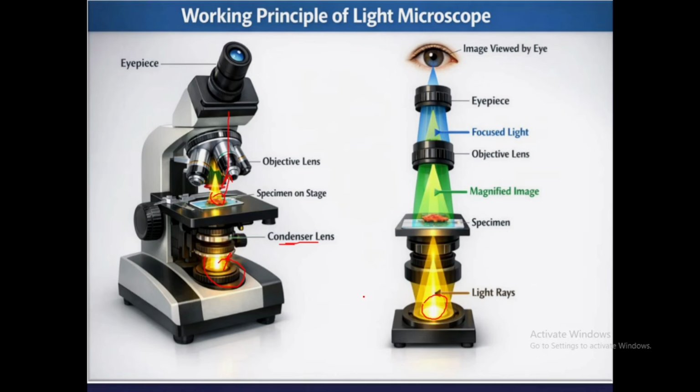With the help of a light microscope we can see tiny structures, or transparent structures, clearly, because the microscope has magnification power and resolution power. Resolution means we can see the magnified image clearly. The light microscope can also make contrast. Contrast means there is a difference between the background and the image, so with this contrast we are able to differentiate the background and the image.